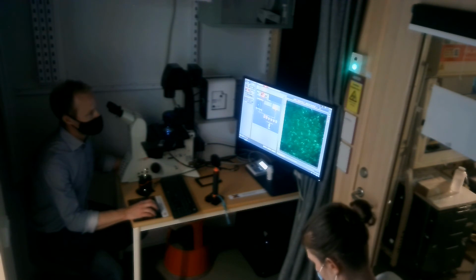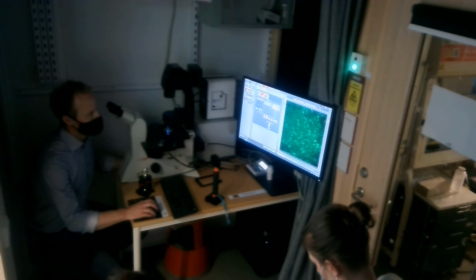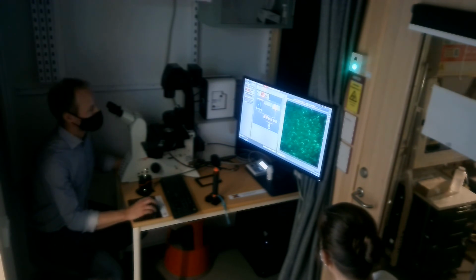But I'm not trying to get necessarily the best image here, but I want to be able to identify something about my sample. So now these settings, I think they will be quite okay for what I need to do for my overview. So now I will start Navigator.